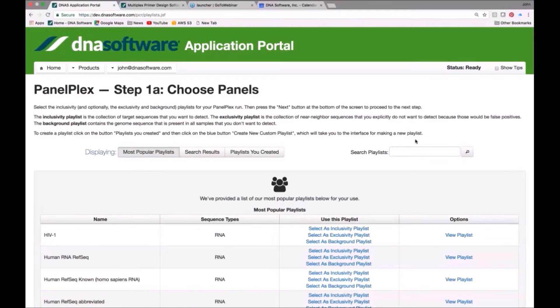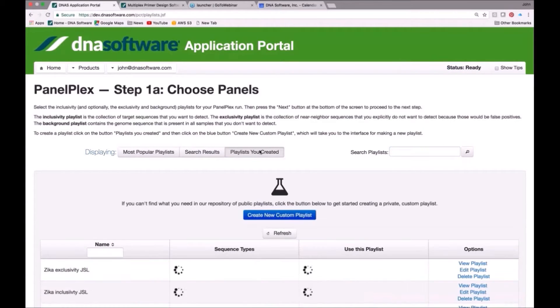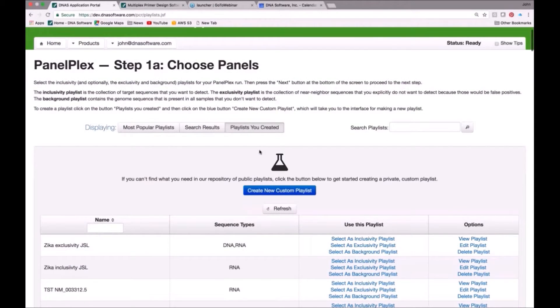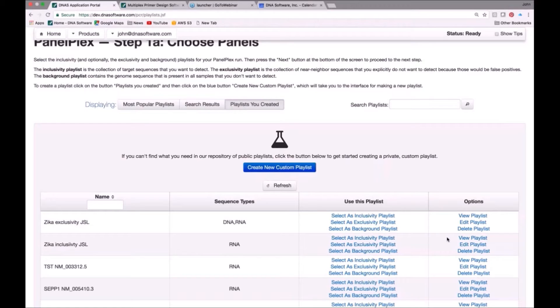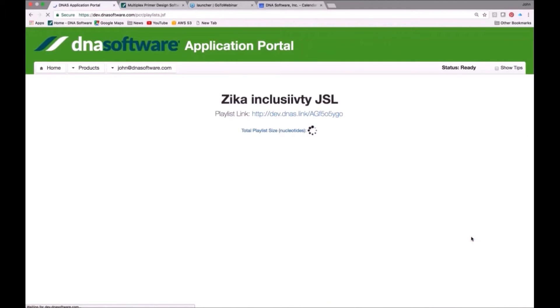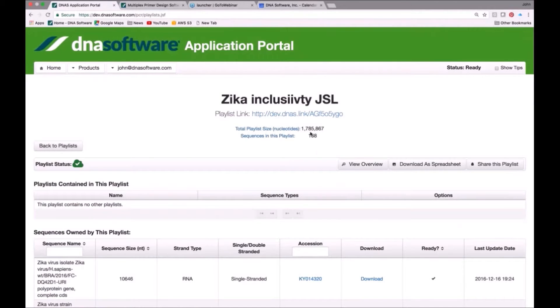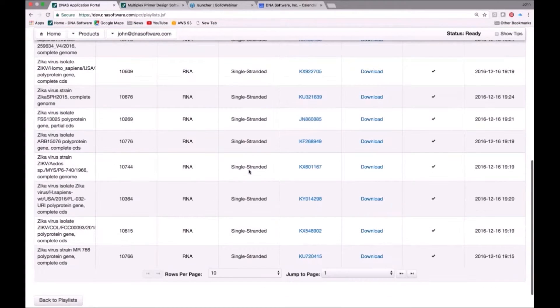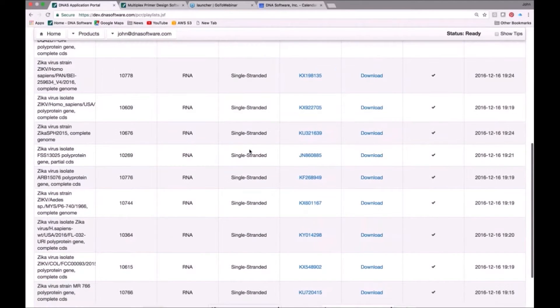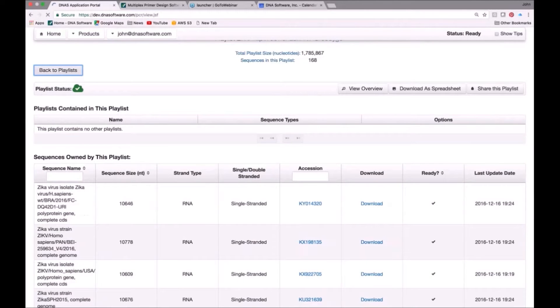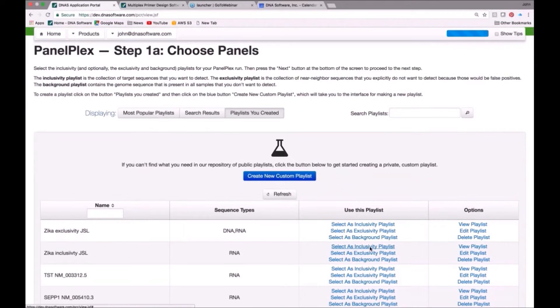Here is a basic step for doing the design in PanelPlex. The first is that we need to choose our panels. I've already set up inclusivity and exclusivity lists for the Zika virus. They're already here, and we have a separate webinar on Thermoblast. This is the same interface we have in Thermoblast for creating playlists and accessing them. For today's talk, I'm not going to talk about how to create the playlist. It's very simple, but we're not going to show that, and instead just show you the results. Here's an inclusivity playlist for Zika virus, for example. It has all 168 Zika viruses, and here they are.